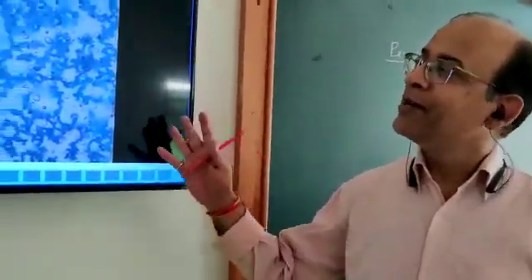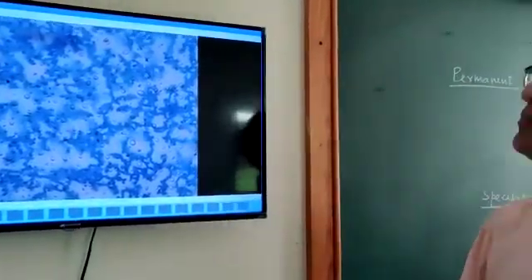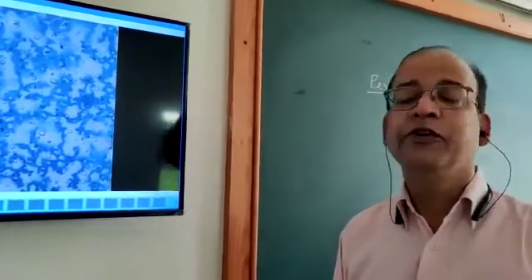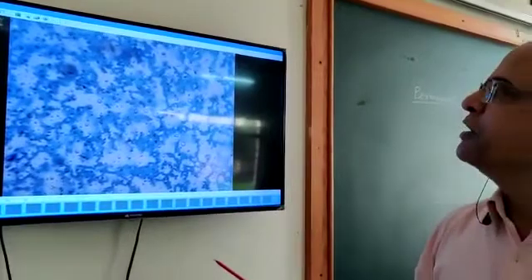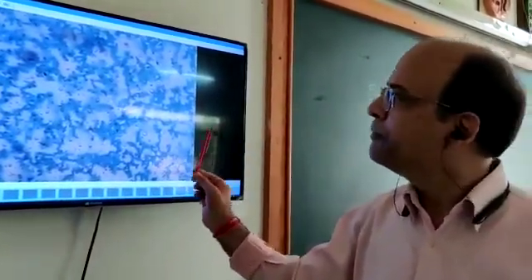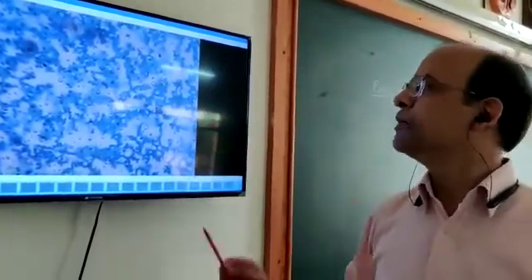I am showing you the permanent slide of a blood film of an infected person suffering from malaria. Malaria is caused by Plasmodium vivax. Here you can see different types of blood cells — all these round cells are RBCs. You can see some abnormal swelling in the RBCs, and here you can see the infectious agents which are Plasmodium vivax. They enter the RBC and multiply themselves, causing malaria.